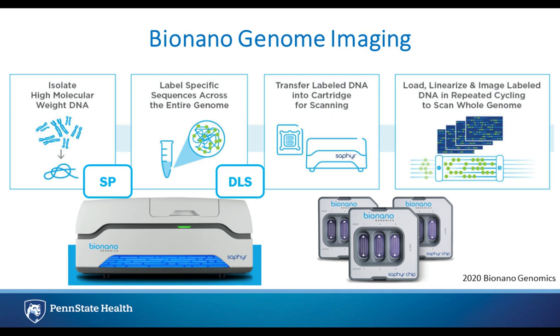Moving on to the Bionano genome imaging platform, after the isolation step, which is the SP, or solution phase, the DNA is then labeled using DLS, direct label and stain. They have a DLE enzyme, which labels the DNA at a 6 base pair sequence motif that repeats throughout the human genome. By doing this, it creates a kind of molecular barcode on the DNA. Then you take this DNA and load it on a Saphyr chip. You can see at the bottom right what these look like. You can load 3 samples on a single chip.